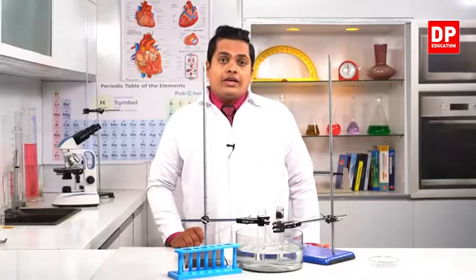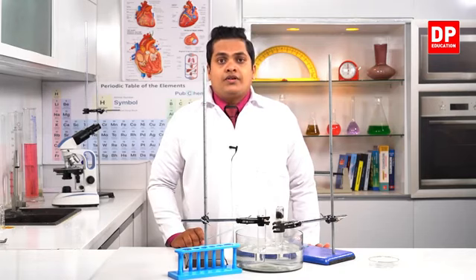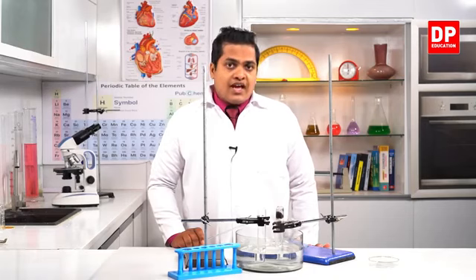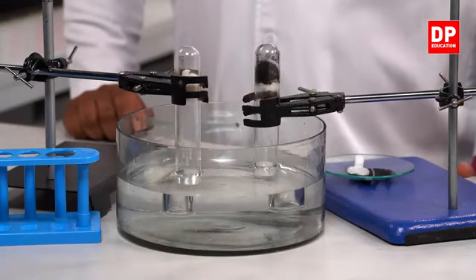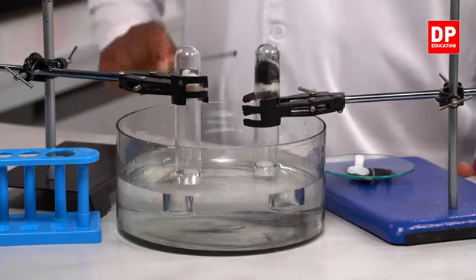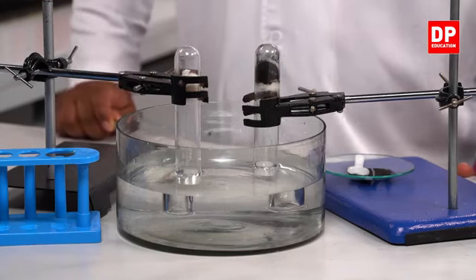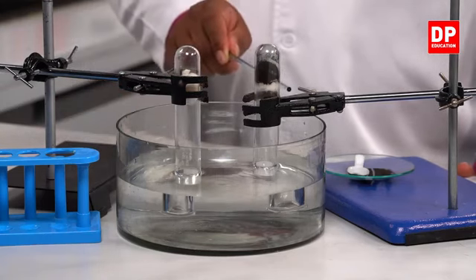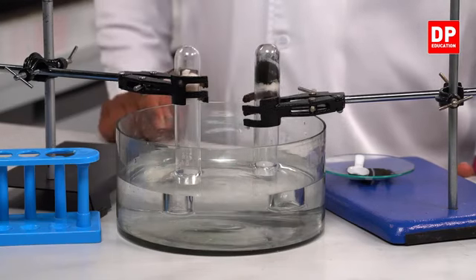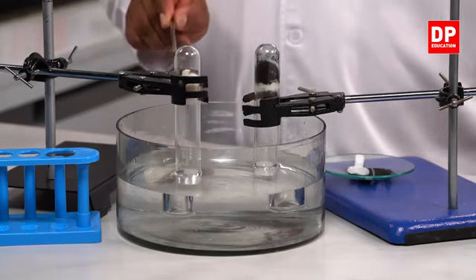So now we need to keep this system for a few days and observe what has happened to these iron filings. Is there any other observation within this boiling tube or this one? Actually, we can get observations only in this one, because this is the one which contains iron filings. So what is the purpose of using this second boiling tube?